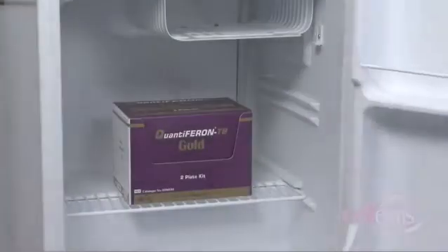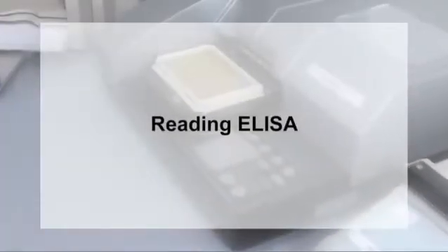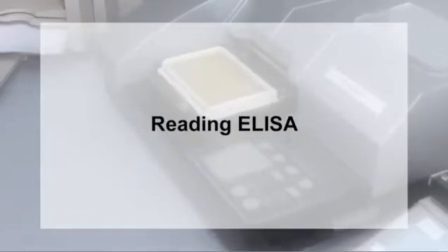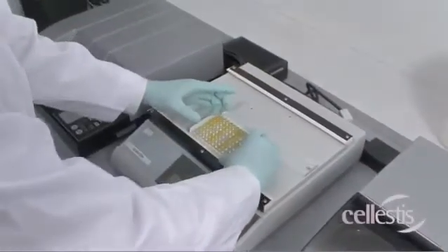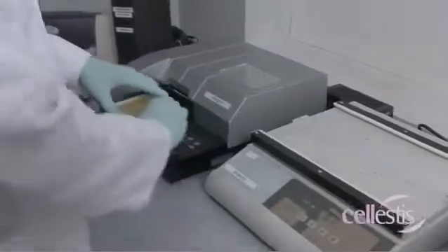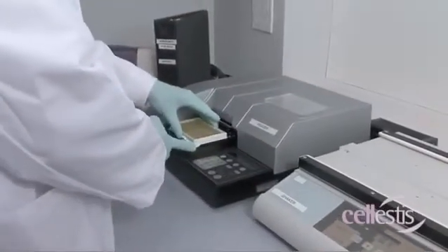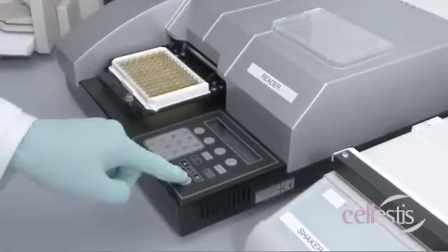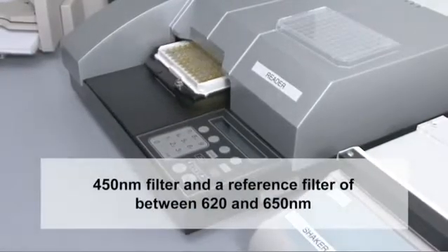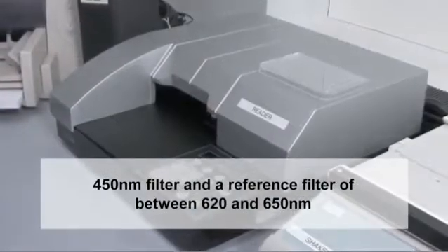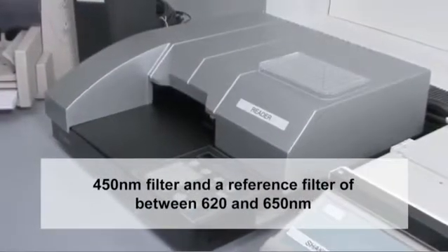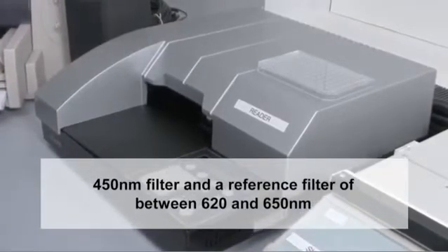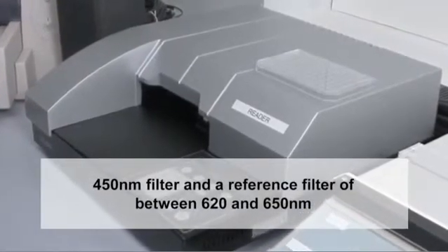Return all unused reagents to the refrigerator for future use. Using the microplate reader, read the plate within five minutes after adding the enzyme-stopping solution. The reader should be fitted with a 450 nanometer filter and a reference filter of between 620 and 650 nanometers.